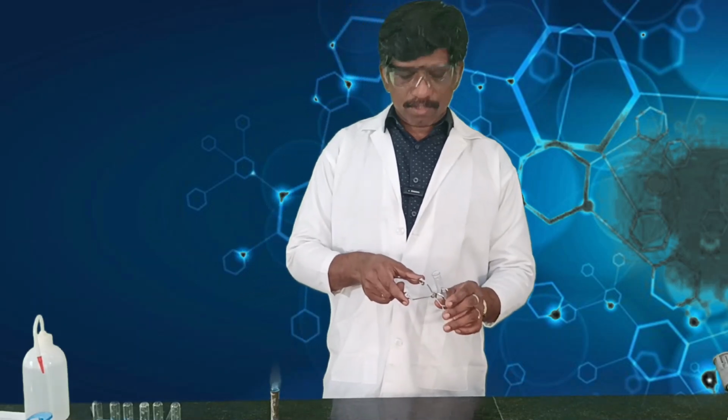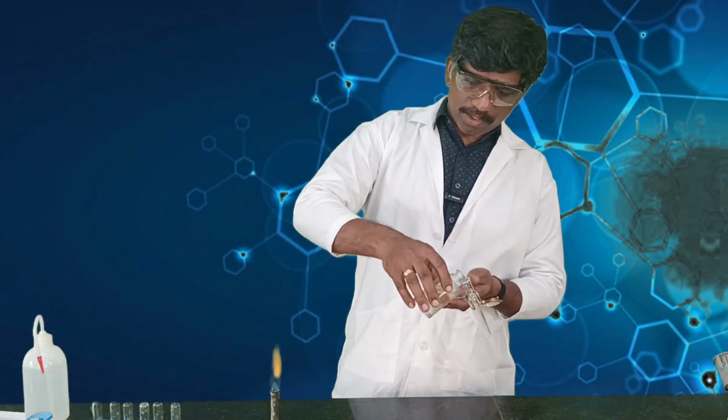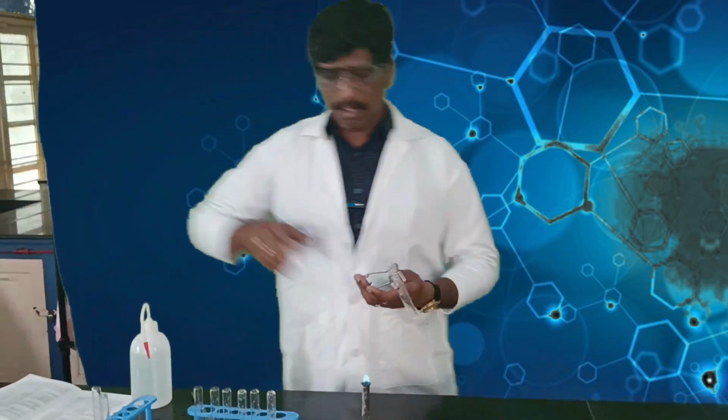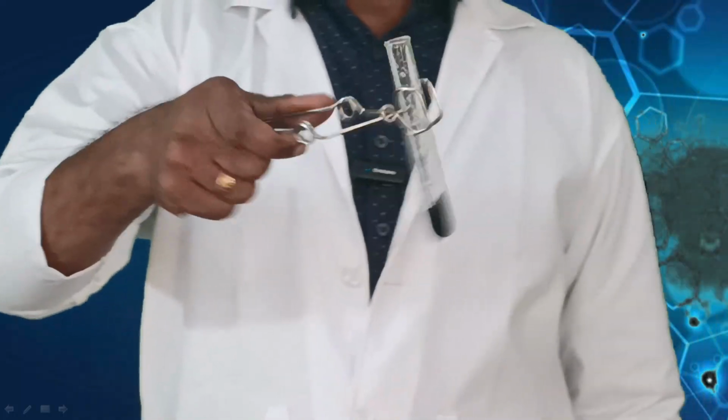Take a little amount of substance and a few drops of concentrated sulfuric acid and heat it in the burner, and you will get the blackening of the substance.